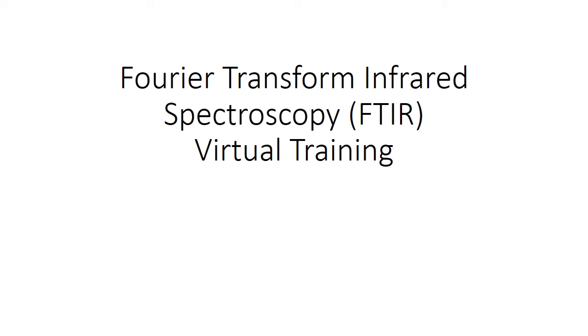Welcome to FTIR Virtual Training. FTIR stands for Fourier Transform Infrared Spectroscopy. We will often abbreviate it just IR or FTIR.